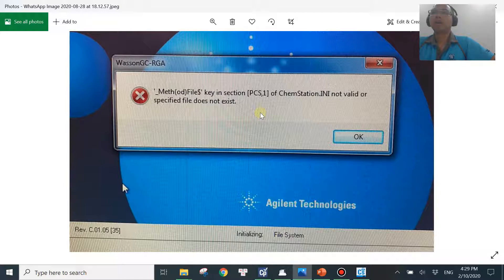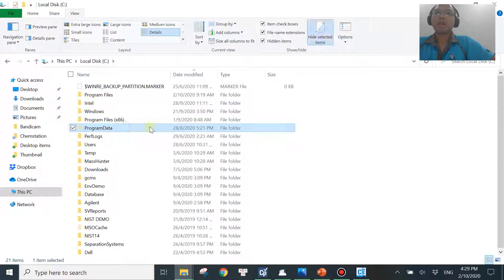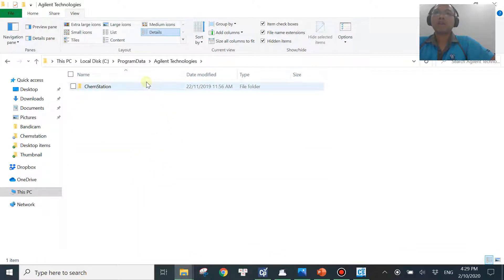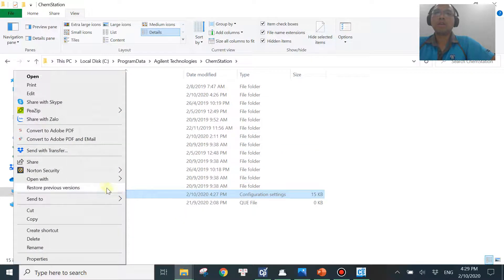To give you a more generic way to fix the problem, first you need to find the file chemstation.ini. Go to the C drive, then Program Data. Note that Program Data may be hidden — go to View and check the Hidden Items box to see it. Then go to Program Data, then Agilent Technologies, then ChemStation. You'll see chemstation.ini — right-click and open with Notepad.